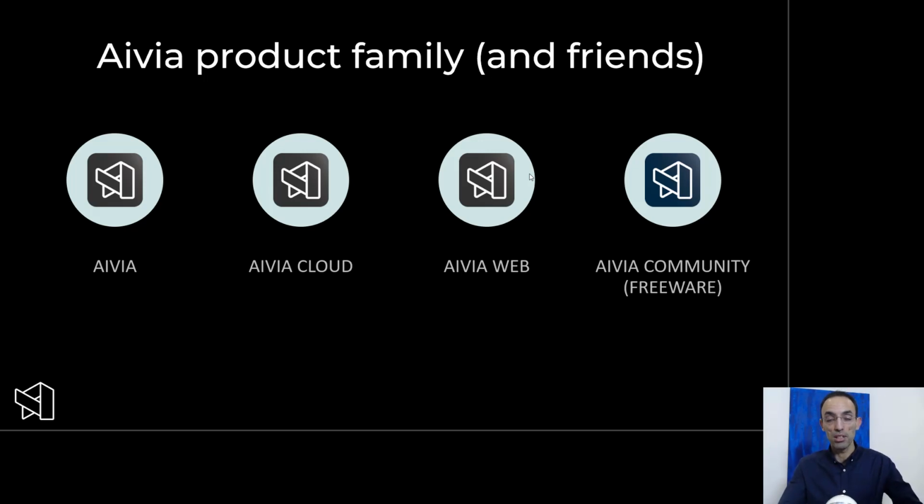Download the software, install it, load your data or your crop that you're responsible for, and then you can annotate that and save those annotations and send those annotations to somebody that has the full Aivia, and they can then either train a model or update the model using the annotations that you created. So it's meant to be a collaborative tool. It's also a great way to visualize data and create beautiful video renderings of the data.